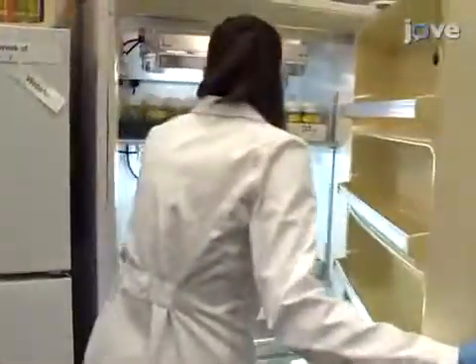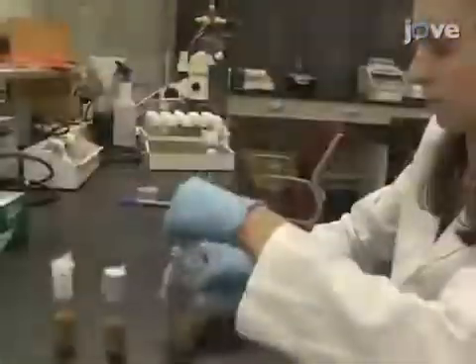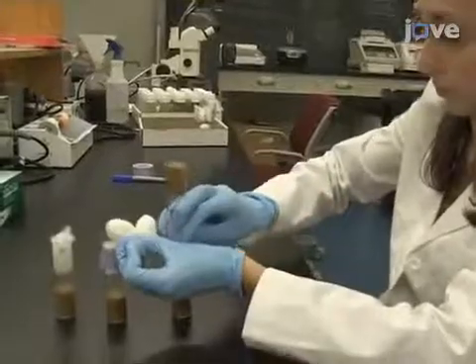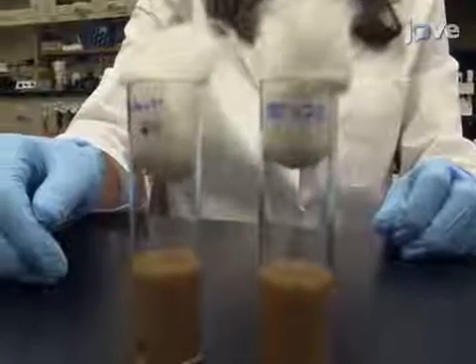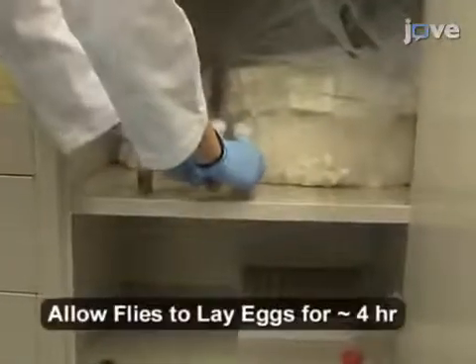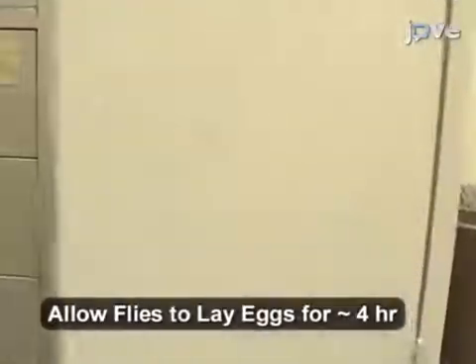After allowing the flies to mate for at least one night, move adults into new vials with fresh media.